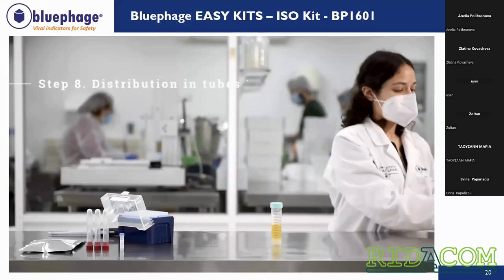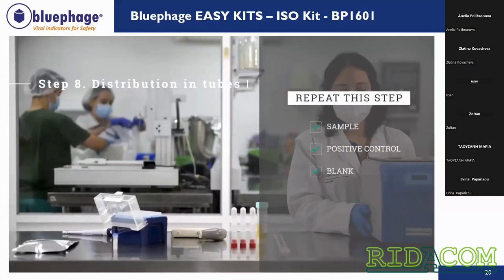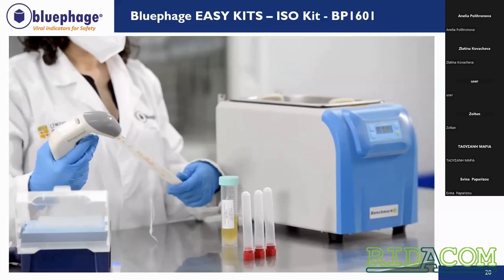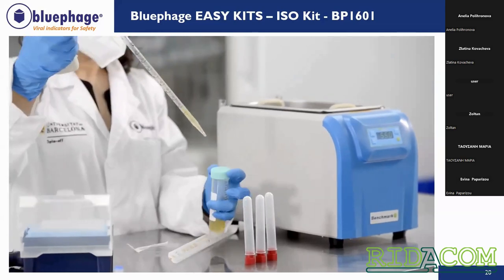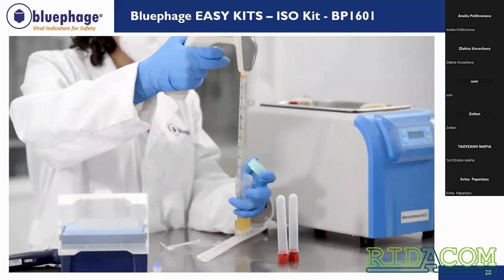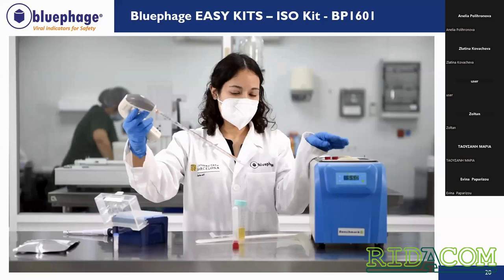So once that the semisolid has been supplemented, what we are going to do is distribute the semi-solid MSA supplemented in our test tubes. And for that, we will distribute 2.5 mils of this mixture in each test tube. And once that each tube has the semi-solid, it must be placed very quickly in the water bath, because we don't want our semi-solid MSA to be solidified due to a decrease of the temperature.